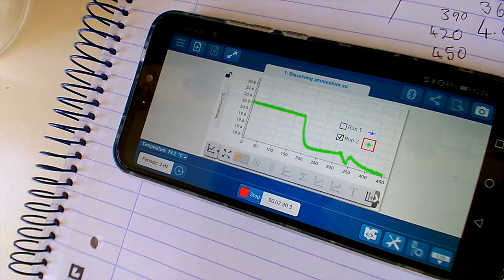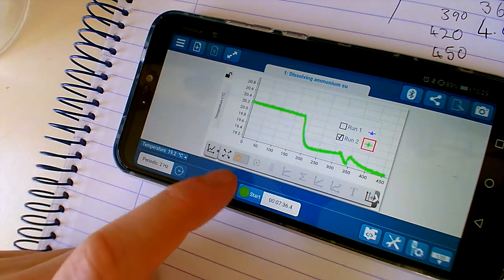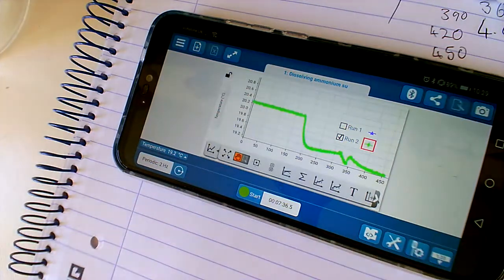And 19.2 again. Right, I think we'll leave it at that, because otherwise we're going to keep getting 19.2. Okay, so we have our graph there. Please have a look at the Google Sheets that we'll plot in the lesson. So I'm going to stop that now. Hopefully we can show the extrapolation on the Google Sheets.